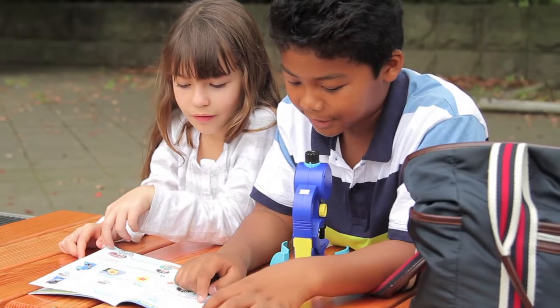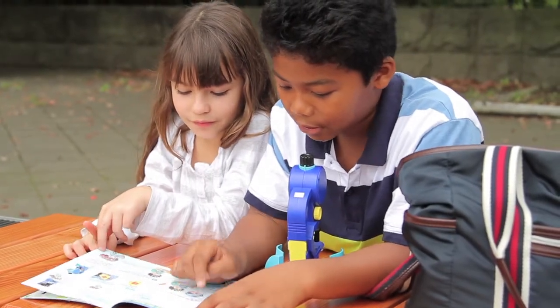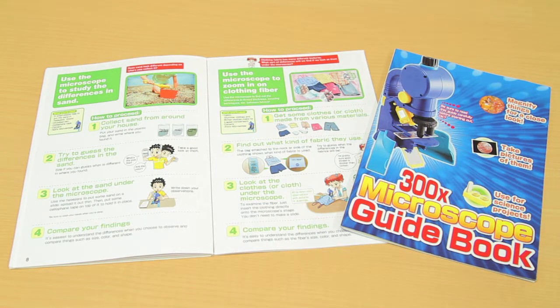The accompanying booklet introduces how to observe sand, cloth fibers, plankton, and pollen, as well as what to look for. Try observing many different things.